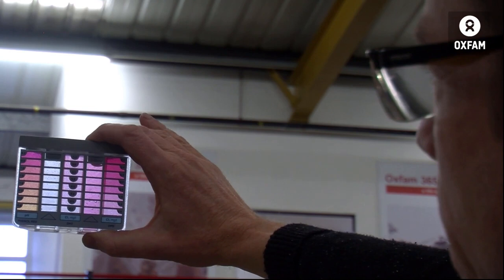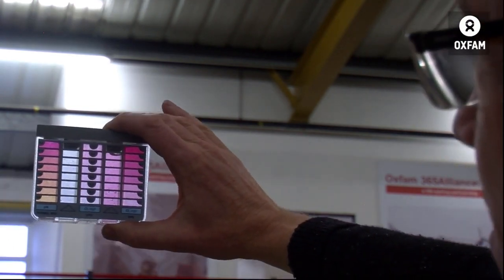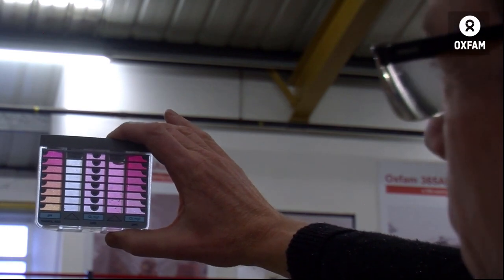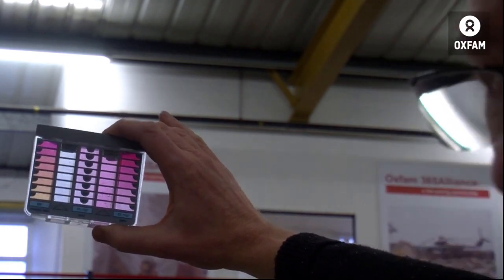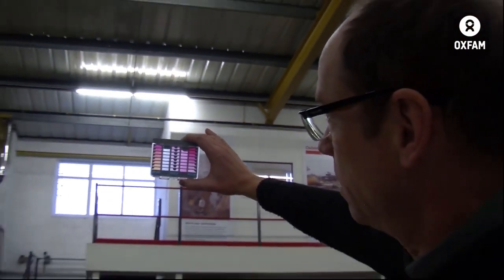They all look the same to me. Yes, thanks Ed, yes they can look the same. It is difficult to tell, so we'll call that 0.6 and we'll see what that compares to the digital photometer.